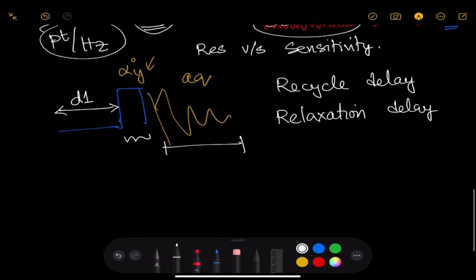As you might remember, the rate at which the transverse signal decays is given by the characteristic T2 constant. The time required to recover the signal or the magnetization following a perturbation is given by the T1 time constant. Going back to the Bloch equations, following a 90-degree excitation from equilibrium, you would end up having zero longitudinal magnetization.